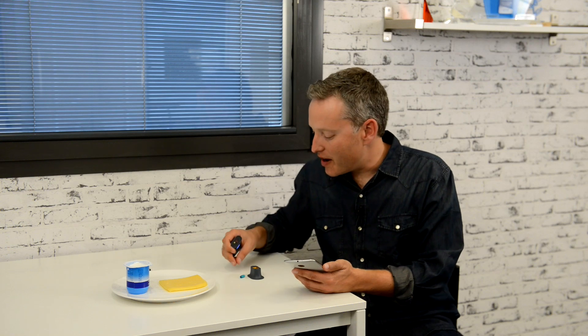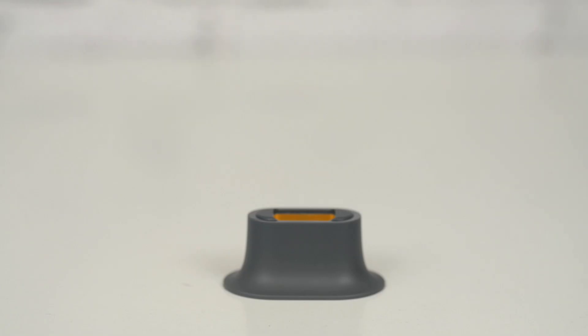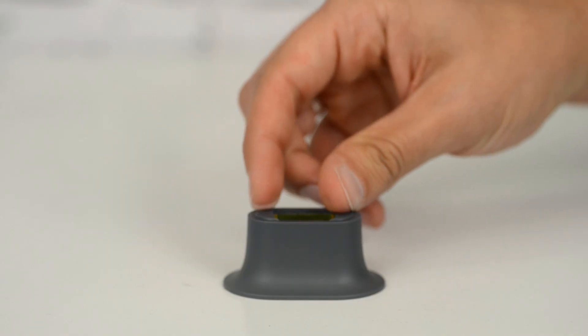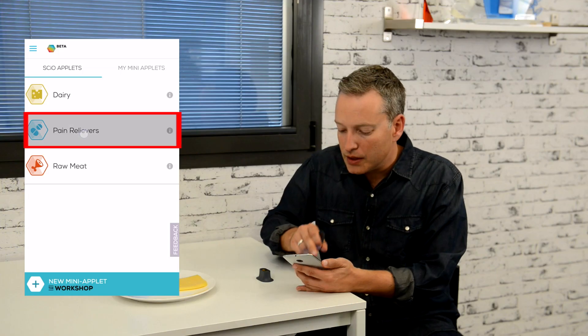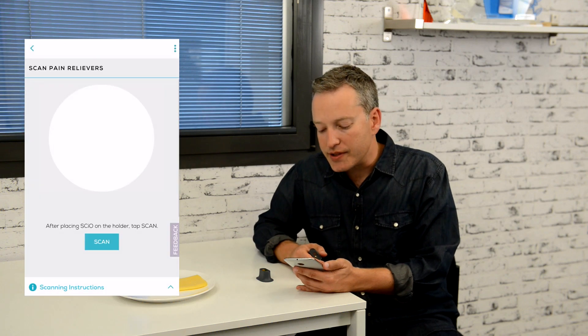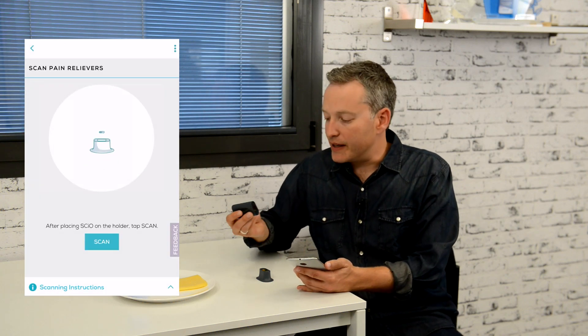Now let's use the pain relievers applet to identify the active ingredient of this over-the-counter pill. Since pills are typically smaller than the diameter of the illumination area, I'm using the small object holder. This ensures that the table isn't scanned together with the pill, and the mirrors on the sides maximize the amount of light returned from the tiny pill. I'm placing the pill inside the holder, tapping the pain relievers applet, and scanning.